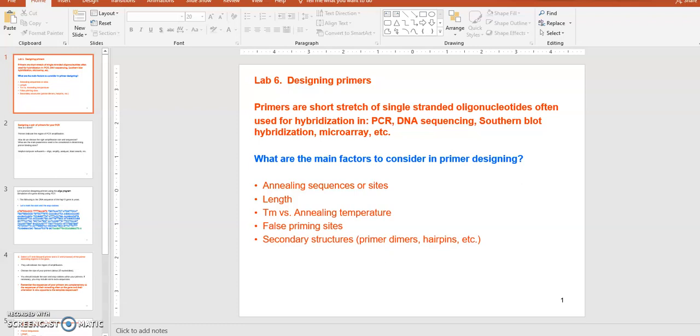So they have a unique sequence made up of those nucleotides, and normally those sequences are important because primers are designed to bind to a complementary DNA strand. When they bind, we call that the primer binding process or annealing process. That annealing or primer binding is required for you to be able to PCR amplify the DNA product into a double-stranded form, or you also need that process for your DNA sequencing process. So primers are used in many different places.